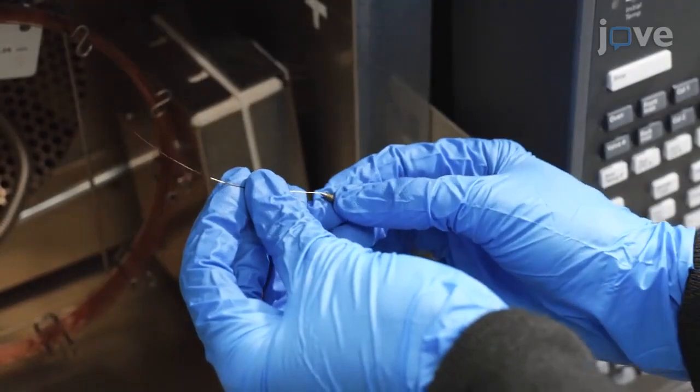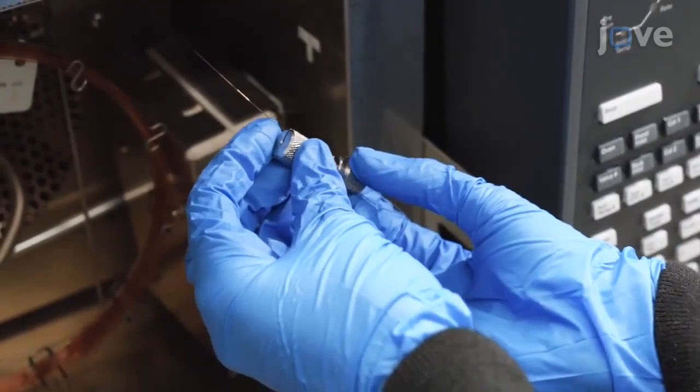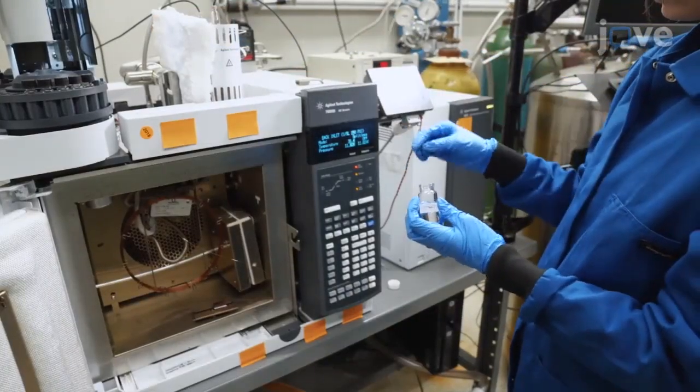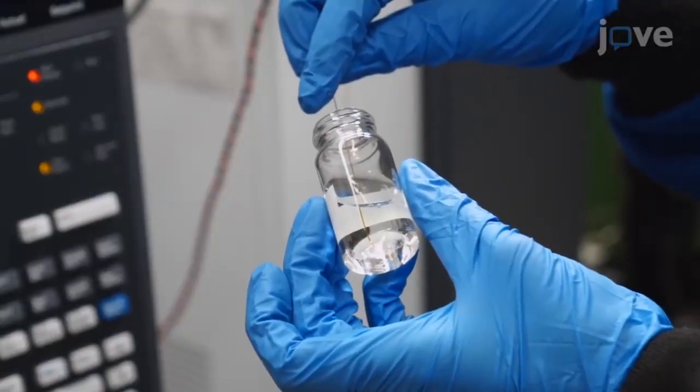Use a micro-union to connect the shorter end of the secondary column to the primary column. To check for a successful connection, turn on the gas flow and insert the open end of the column into a vial of methanol. A successful connection can be confirmed by the presence of bubbles.